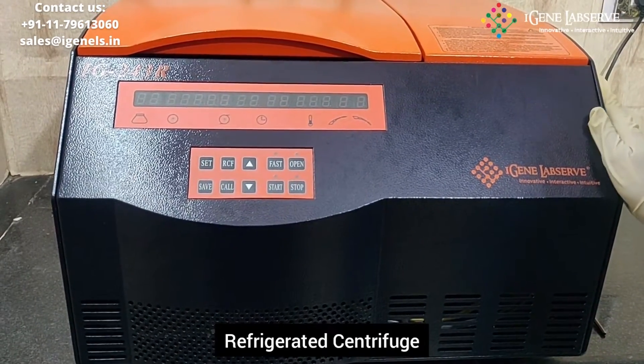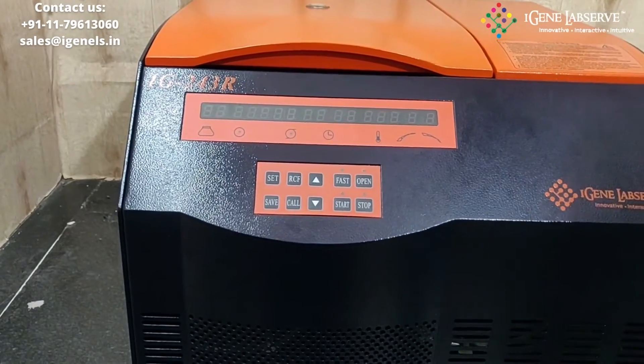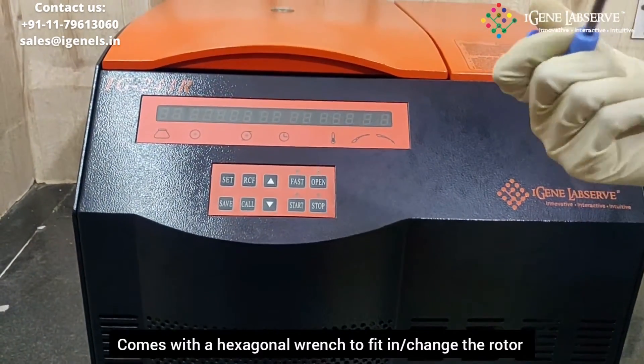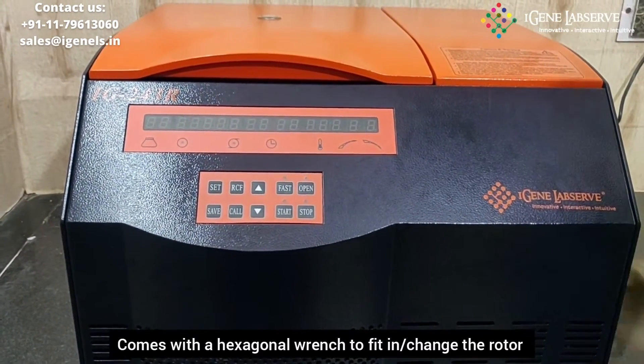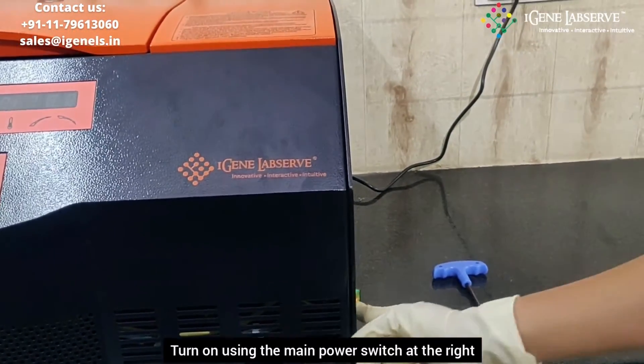This is IGN's refrigerated centrifuge with model number IG-243R. It comes with a hexagonal wrench for fitting in the rotor. To turn this on, you have to use this switch which is fitted on the side wall.